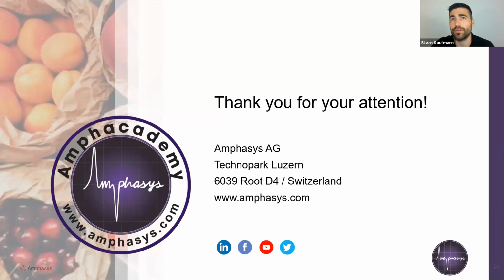And the pollen was stored or preserved dry and not in the buffer, right? Yeah, that's also important. Thank you.